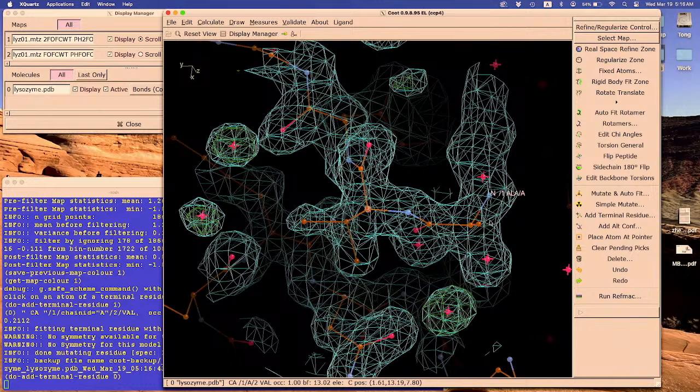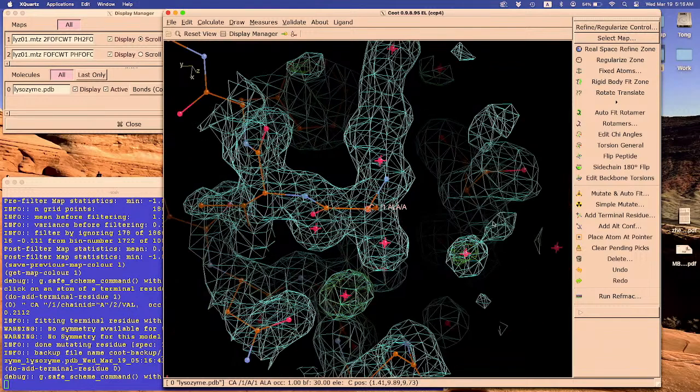And then you can do shift space bar. That goes back one residue, to the residue we just built, which is alanine 1. Please speak up if you are falling behind, okay? Are we still okay? All right.